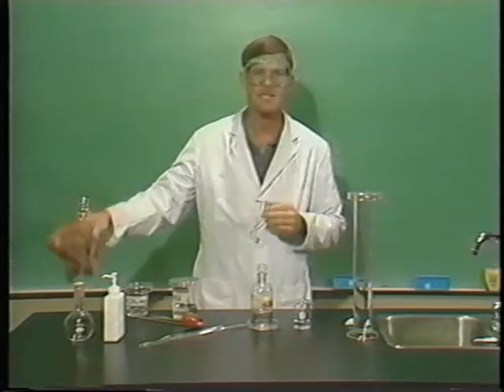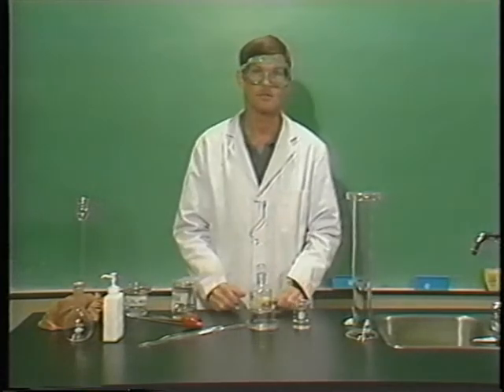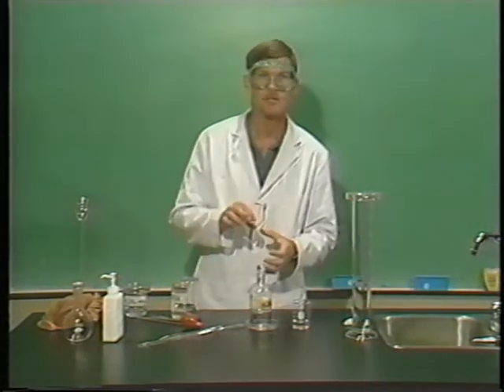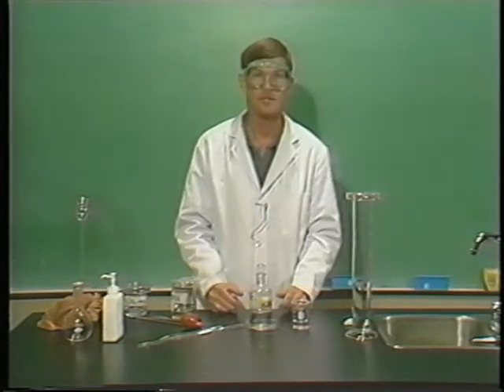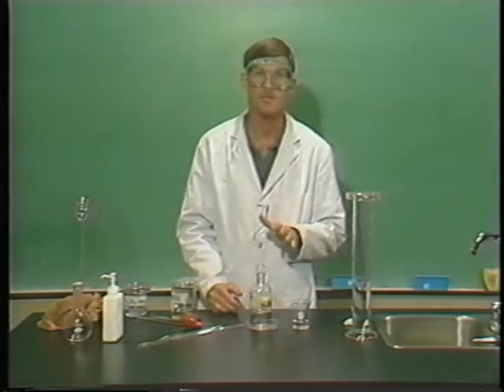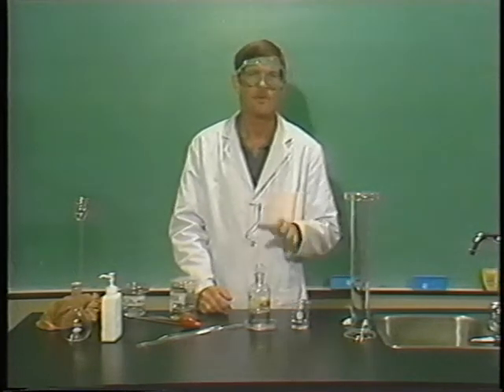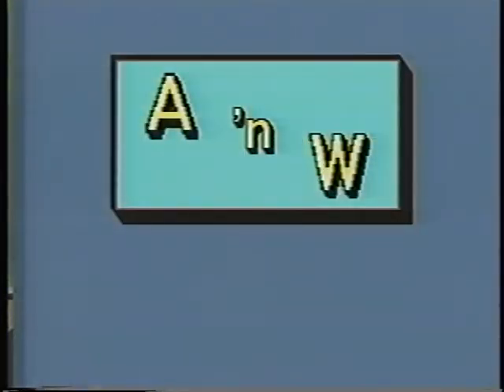Sometimes we have to mix acid and water to dilute it down. The main question is, which do we pour into which? The acid into the water or the water into the acid? One way is very dangerous and the other way is the safe way. Well, the way to remember this is the famous A&W root beer rule.